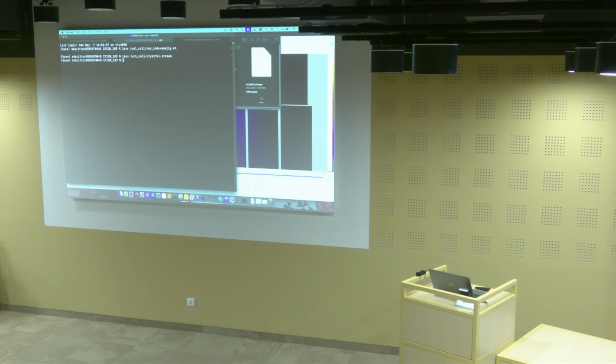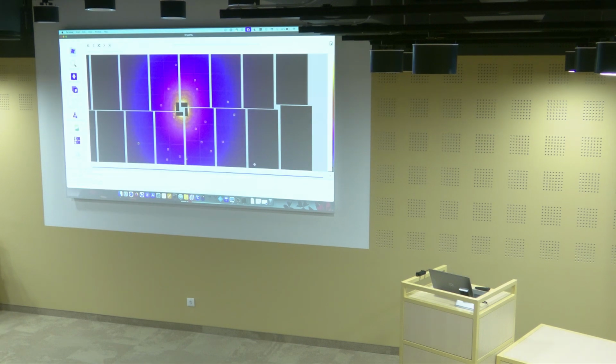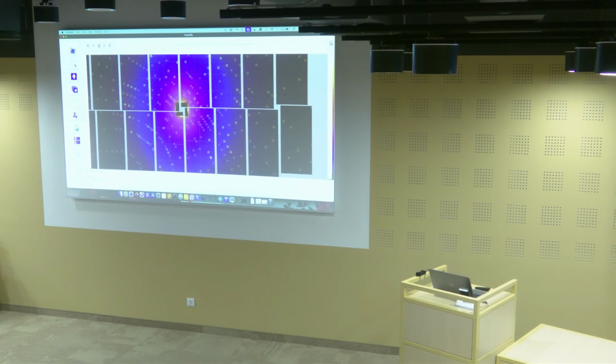Good. In the meantime, my indexing here is finished, because it was cancelled before and now it's across, so I can close it. And here we're going to show the results from our run that we did before, so run 1 cell. So that means that now for every image, I can look at the indexing results.